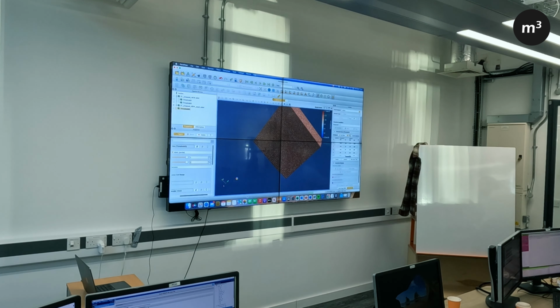It's coming. Right, so this is exactly the same as before. Because it's a partial mask, it's only applied onto the cell data, and we can just get back to exactly what we had before with the mask.